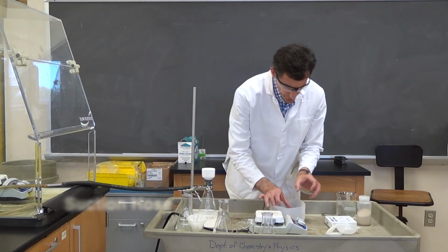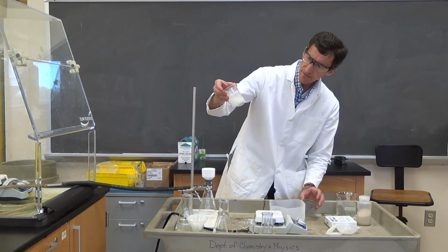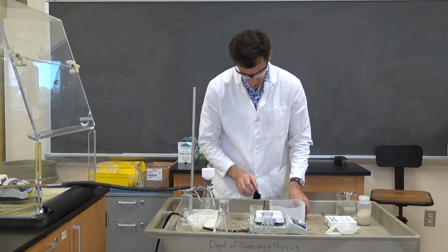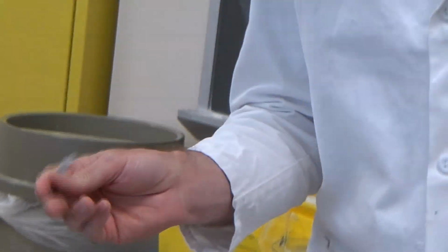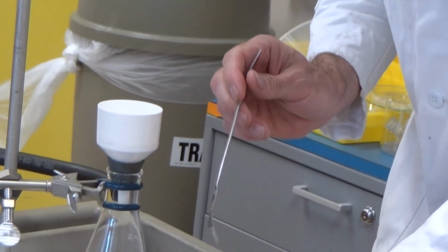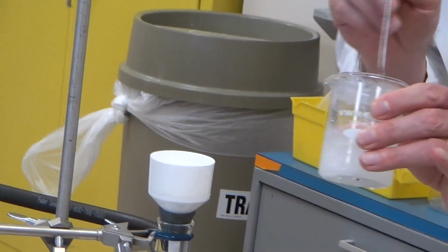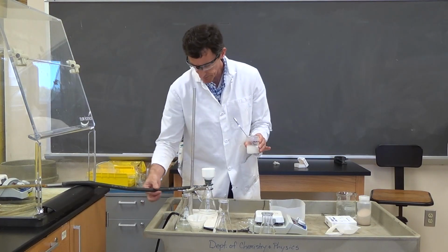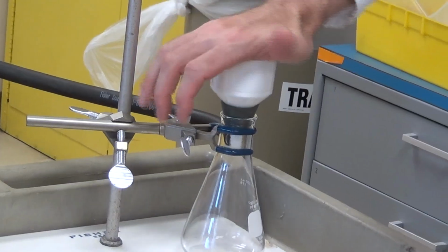Okay, at this point, our recrystallization has been in the ice bath for about 5 to 10 minutes. Good amount of solid here. At this point, we're going to suction filter it. Good to have a little spatula here. Some of my solid is sort of adhered to the glass. I'm going to sort of scrape it loose. I've got my suction already turned on. Neoprene adapter, good suction here. I can feel it with my hand.